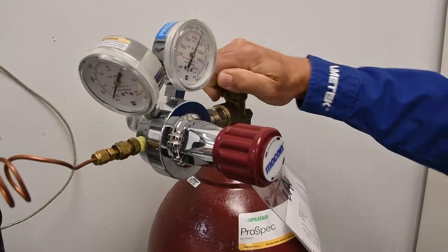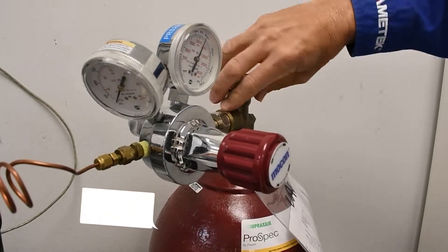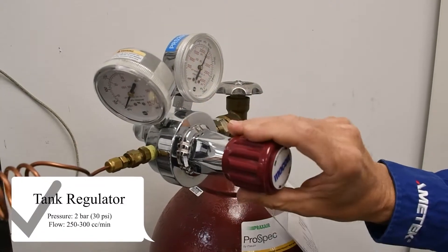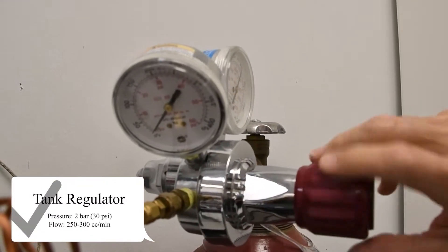Open the main tank valve and adjust the tank regulator to the following. Pressure, 2 bar or 30 psi. The flow, 250 to 300 cc's a minute.